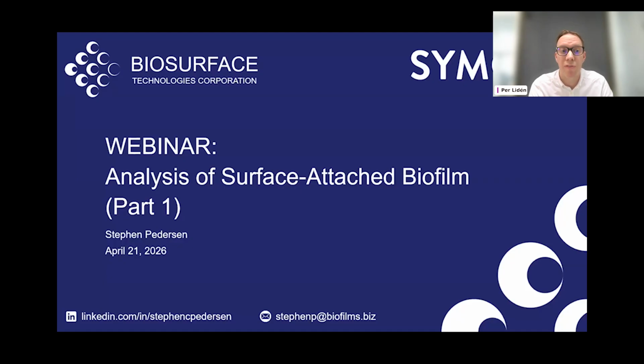After that, Fauve Vergauwe, application scientist at Symcel, will give you an overview to calorimetry-based biofilm testing and the workflow used when running microbial testing with a calScreener instrument. She will then also give you examples of data and applications.